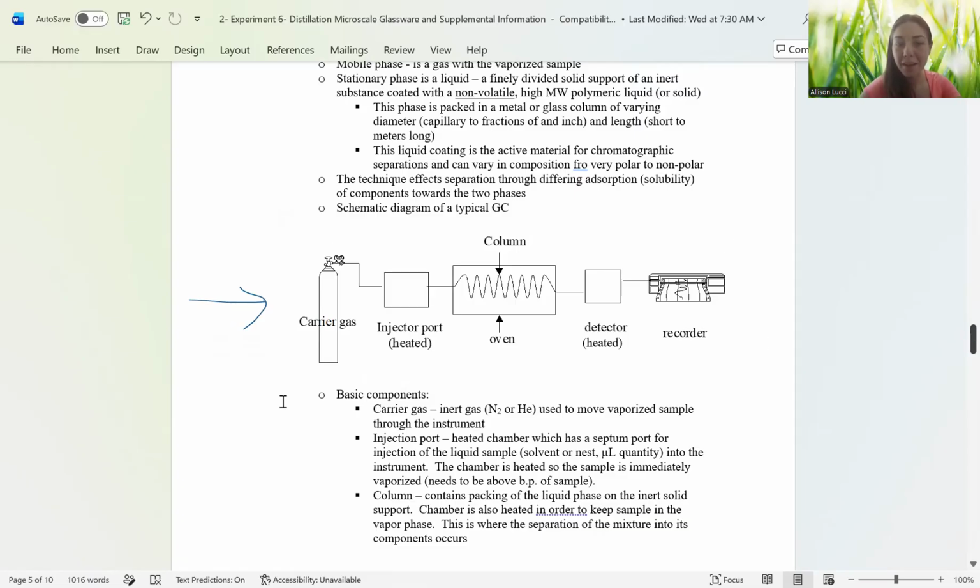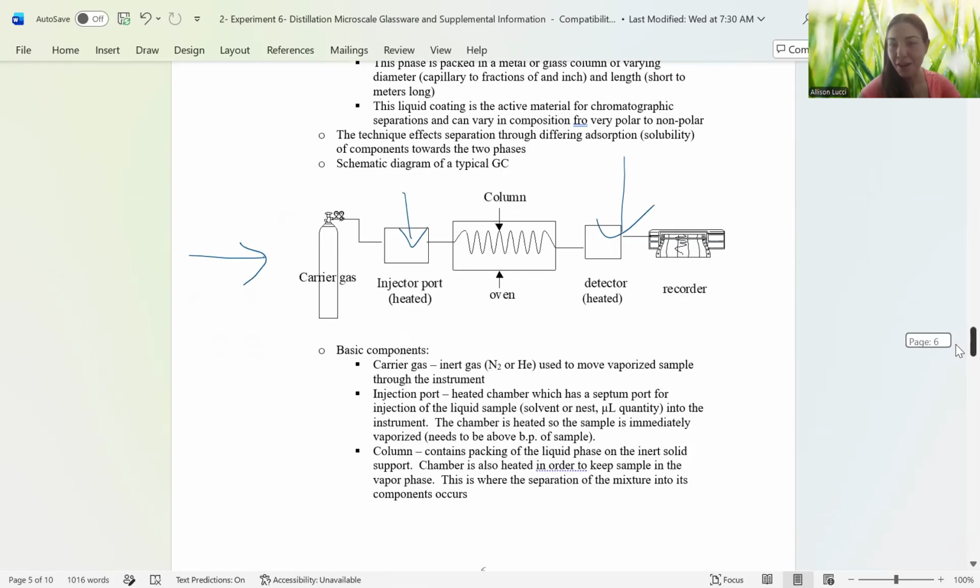We usually use a carrier gas if we use a fancier, more expensive GC unit. But the units referenced in the video in document 1 actually use room air as our carrier gas. We would inject our specimen, it would pass through the column, it would be heated, and depending on its retention time, it would hit the detector. Each component would hit the detector at different times. So again, we're going to identify from our data, our graphs, what our retention times are.